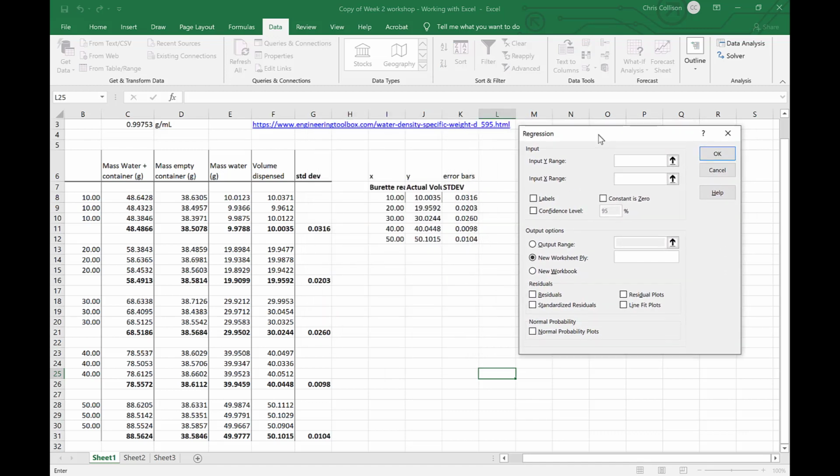And I'm going to show you something here in Excel that allows you to do a higher level of statistical analysis of your data and actually provide that quantified error bar, the quantified errors for a particular experiment that you run. And it all is done within Excel. So there's less that you have to do on a piece of paper.